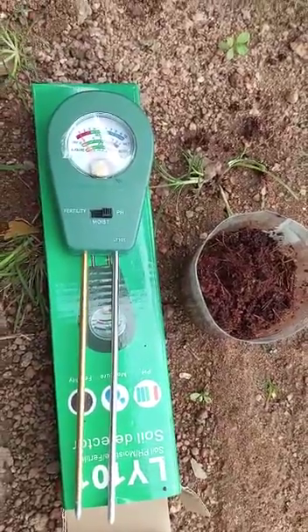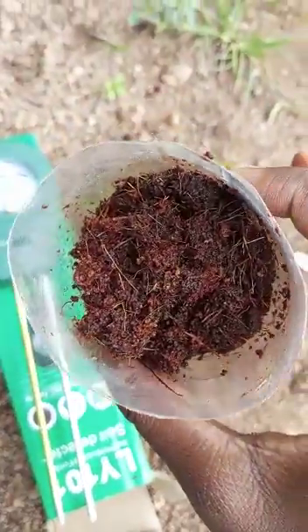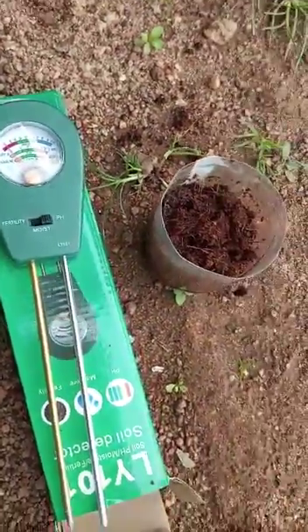Here is a soil fertility meter and a sample of coco peat. I put this in here and added water to it. We're going to test for the fertility, the moisture, and the pH level of the coco peat.